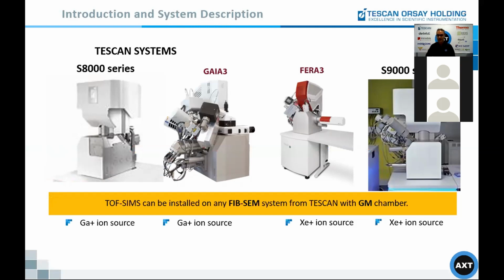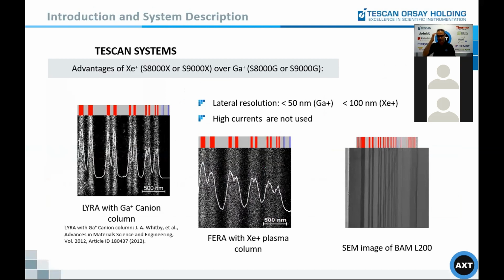If we use a plasma FIB instead of gallium, there are a few pros and some cons. I'm just going through those. Xenon plasma generates a lower resolution image because the beam is much larger. However, xenon ions are a lot heavier, which means the ionization rate could be improved a little.